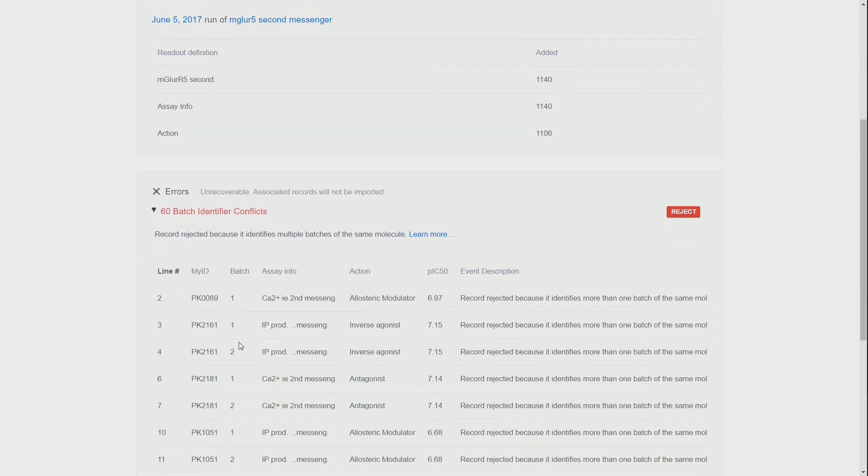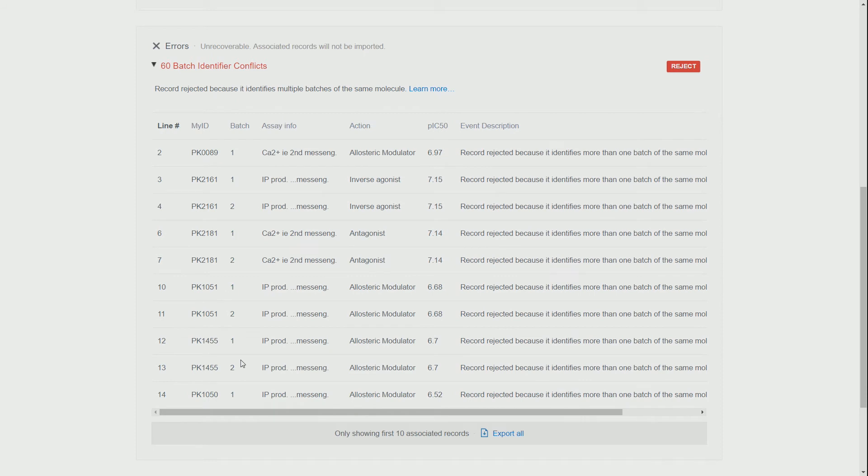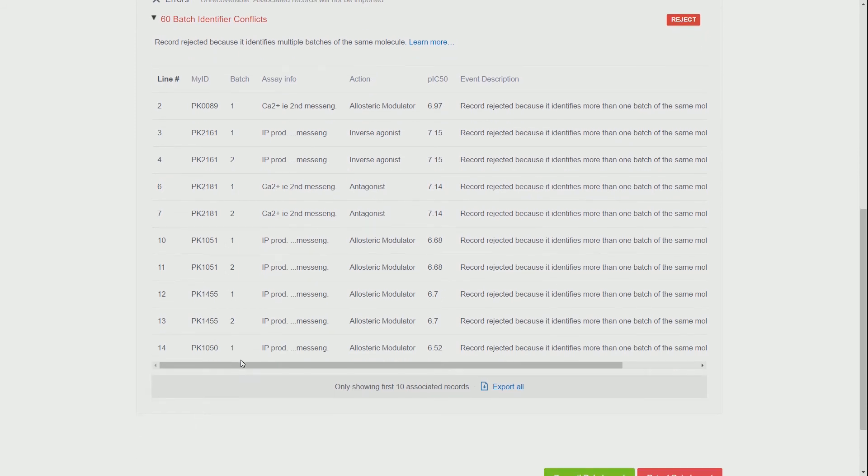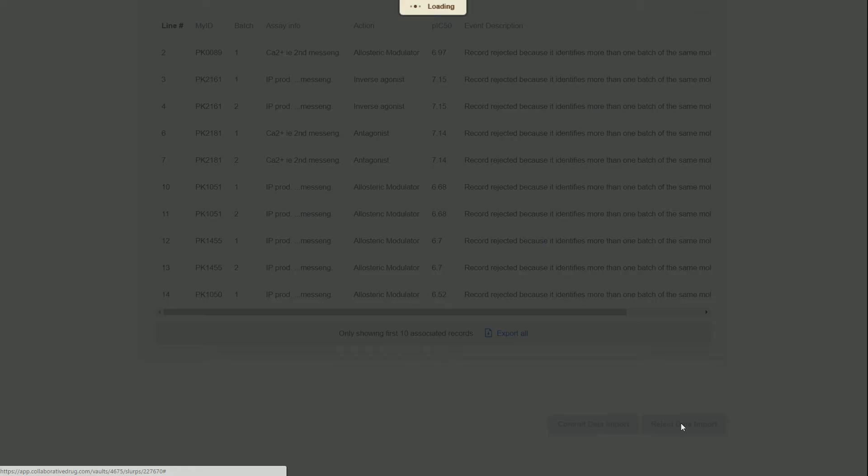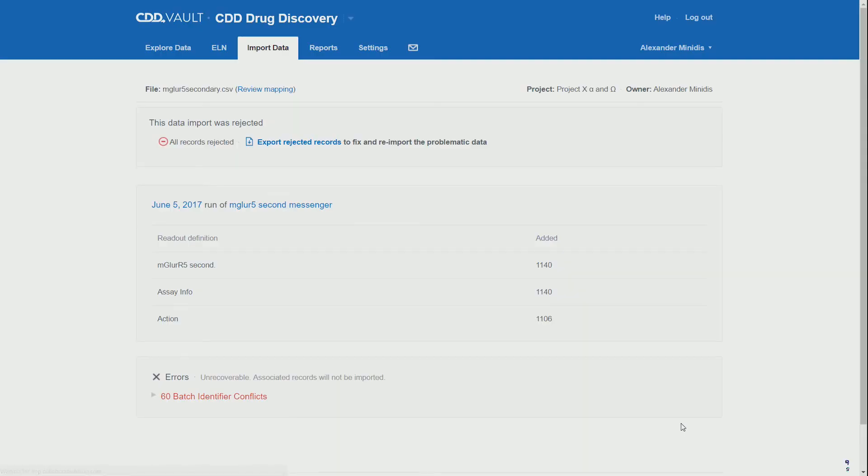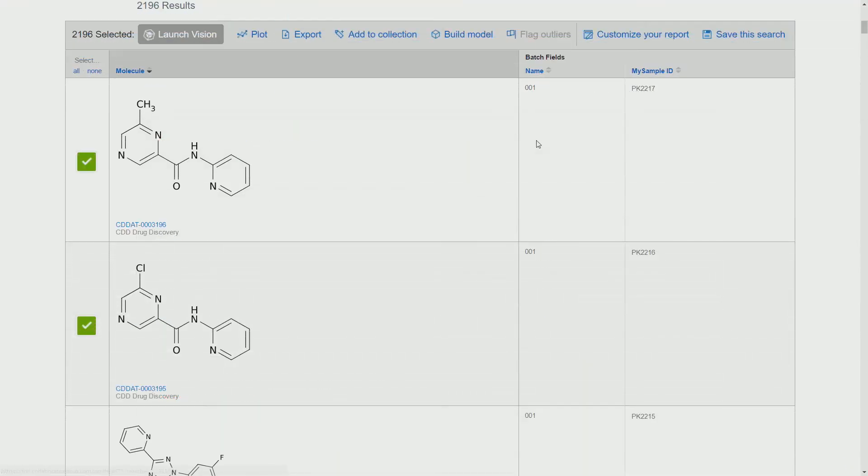We will see this here when we import this: we will have several batches with identifier conflicts. So we will once again reject this data import and we will go to our structures.